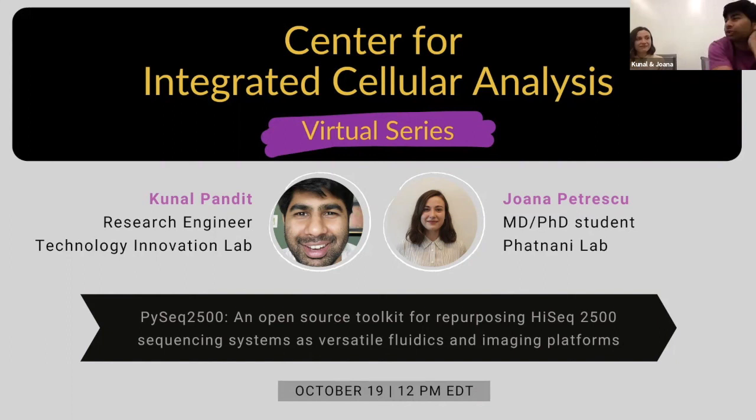You could just measure that ROI yourself. We haven't built any sort of on-the-fly adaptive imaging except for the autofocus. But the imaging time, especially if you're just doing one Z-plane, is fairly fast. We can probably image a whole human section in under 10 minutes with one Z-plane.